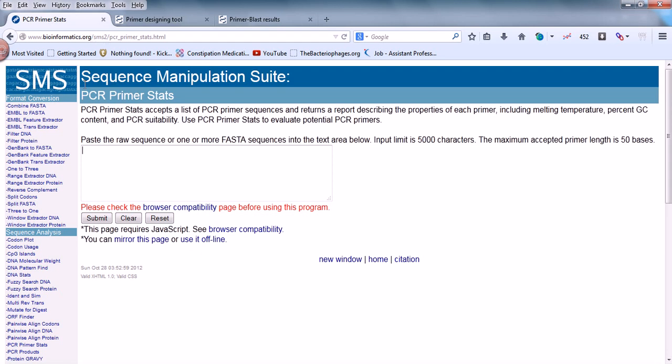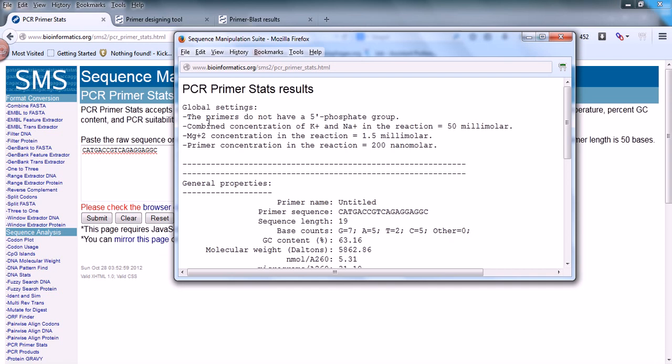Here you can select sequence analysis. You can paste the raw sequence here. This is the forward primer sequence of my choice. I just submit it and it will give me the result.